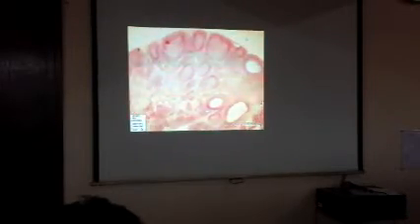There is only one efferent lymphatic vessel, and it leaves the lymph node via the hilum. Unfortunately, there is no hilum shown in this slide, but the hilum looks like an invagination of the capsule where the efferent lymphatic vessel and other blood vessels exit the lymph node.